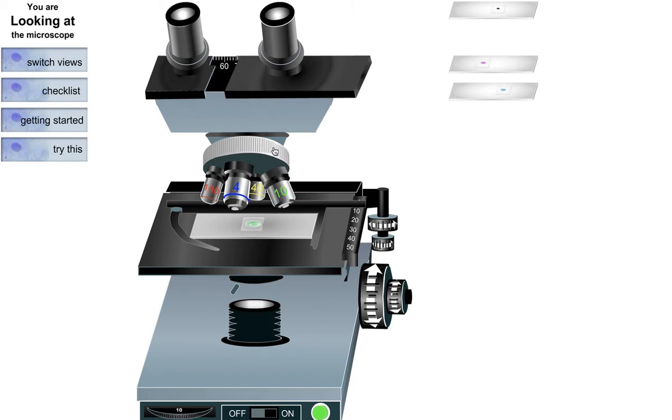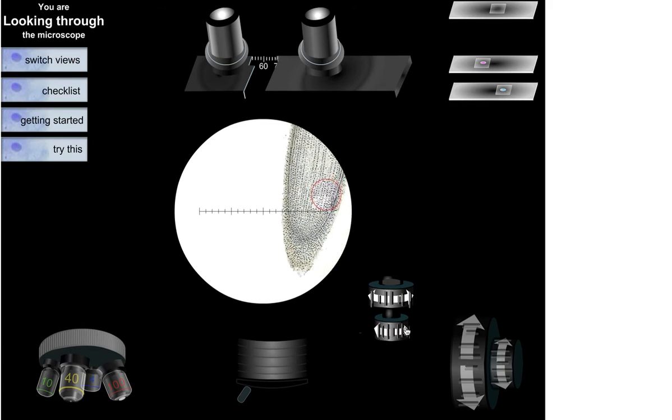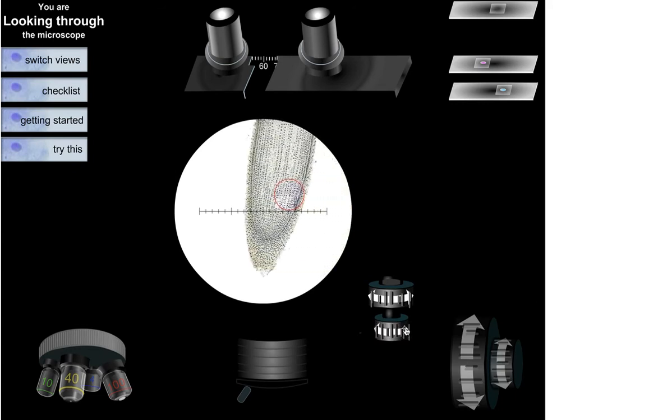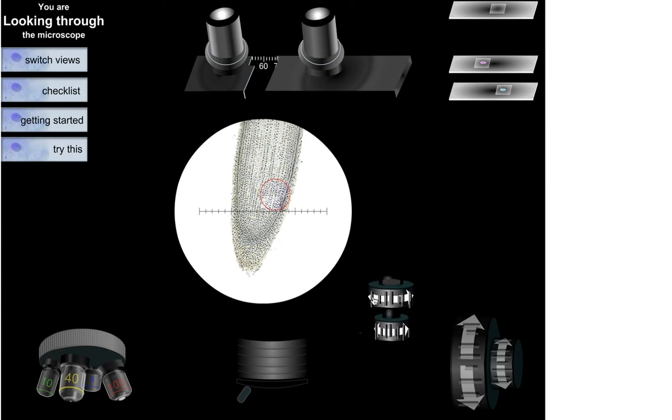Sometimes it's just finding the right mouse movement. Okay, good. Yeah, so this one actually is a little more interesting than the E. And then you can move a little bit back and forth until it's centered. And so it wants you to look at this circle. So we'll try to center on that red circle. It's kind of fun. Yeah, it does feel a little bit more like a microscope, which is really nice.